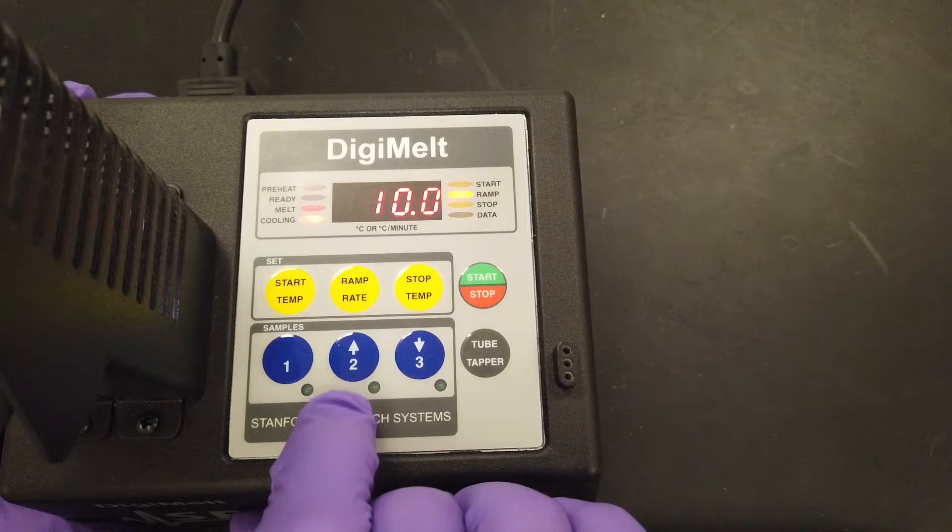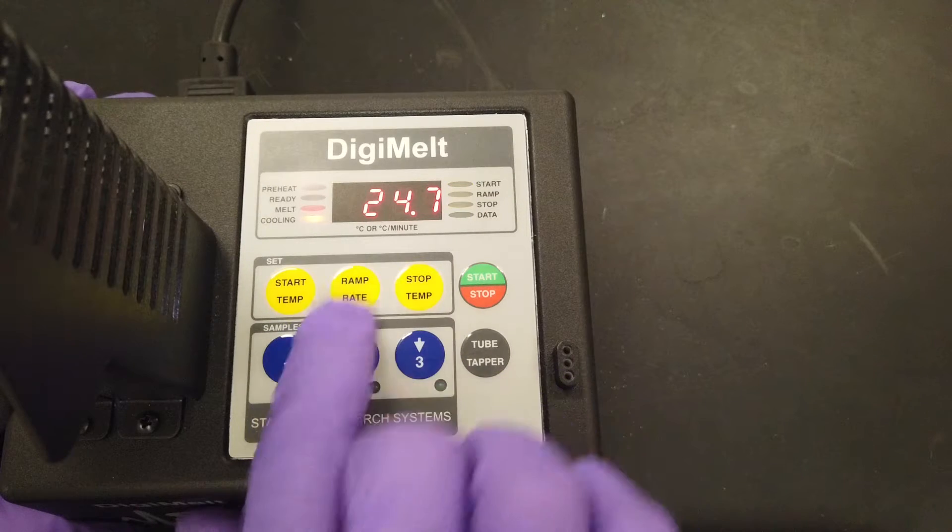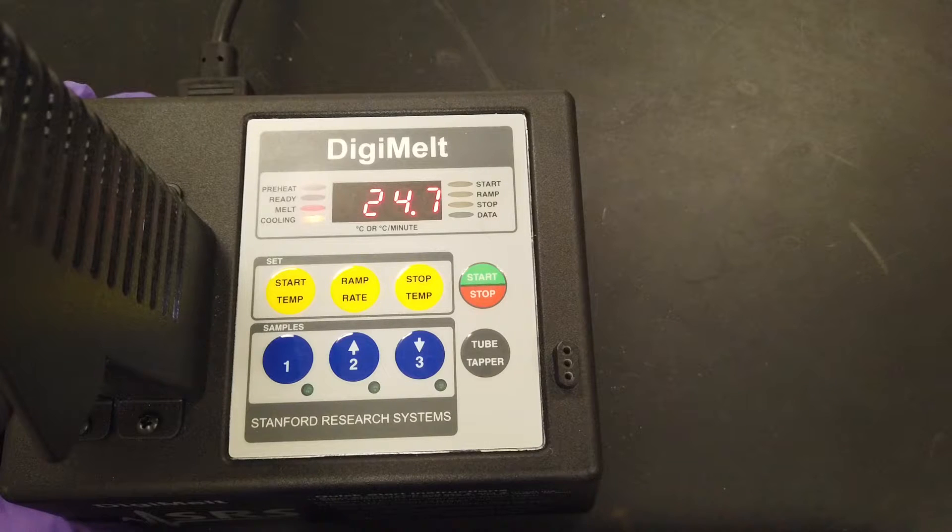It can be useful to set this to 10 when you have a high melting point because this will bring the apparatus up to temperature faster. Just remember to lower it once you're ready to begin.